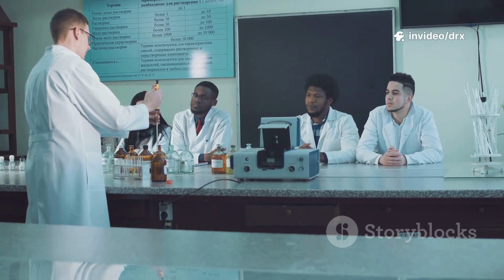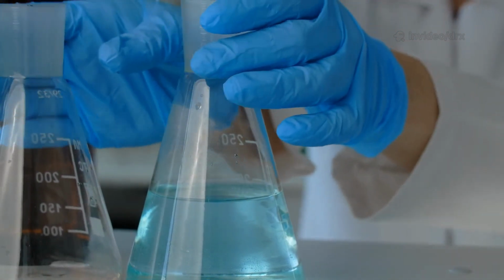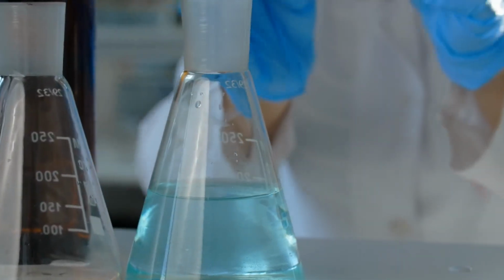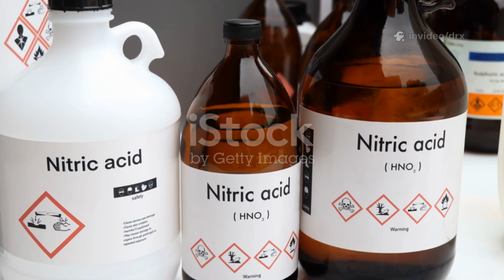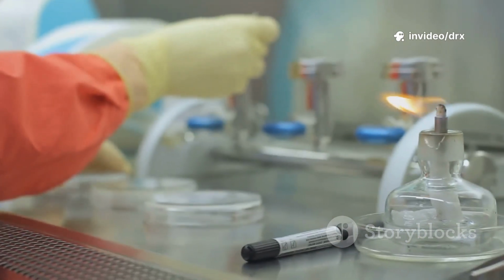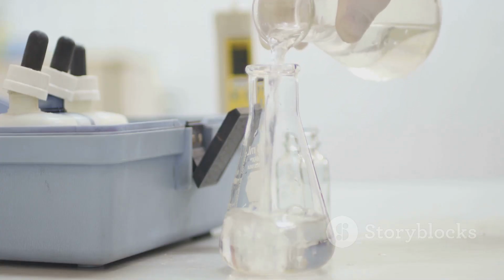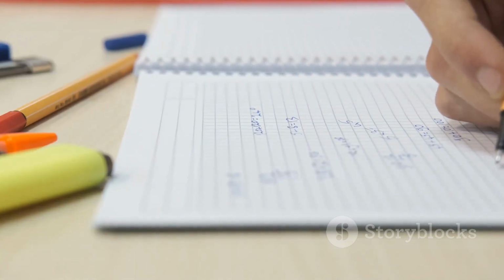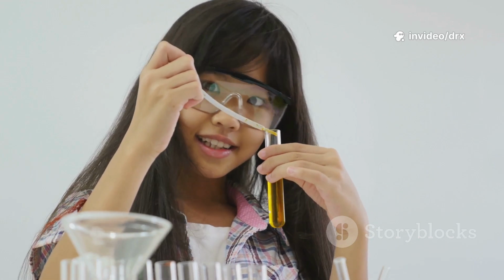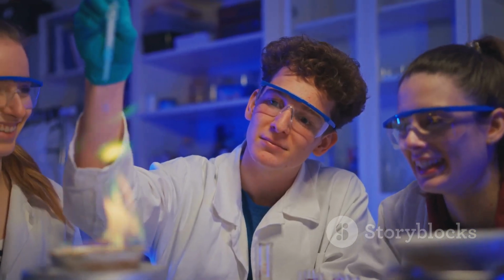Alright, let's walk through the procedure step by step. First, you need to prepare the sample solution in a suitable non-aqueous solvent, like glacial acetic acid, for example. Next, select the appropriate titrant. Perchloric acid is a common choice here. Then, add 2 to 3 drops of the indicator. After that, titrate slowly until the endpoint color appears. Once you see the color change, note the burette readings carefully. And finally, repeat the titration to obtain concordant values. That's pretty much the whole process.